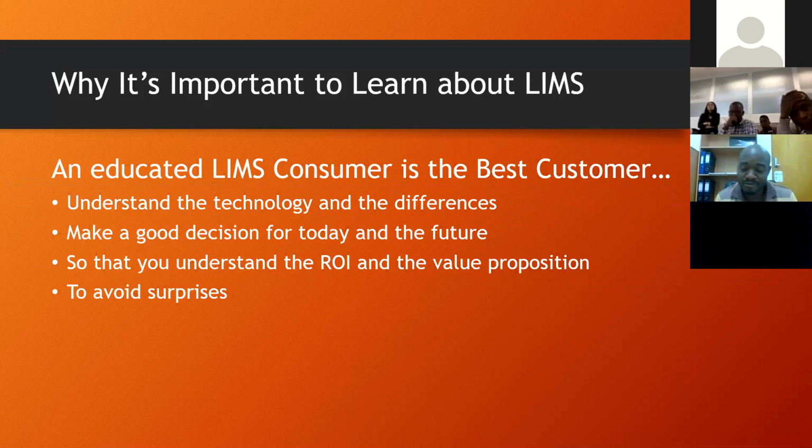Right, I'm going to take you through LIMS. When we hear the word LIMS or LIS, you may think that they are all the same. In as much as they attempt to provide the same output, they are basically not the same. They have different maturity levels, which is something that we're going to discuss now.